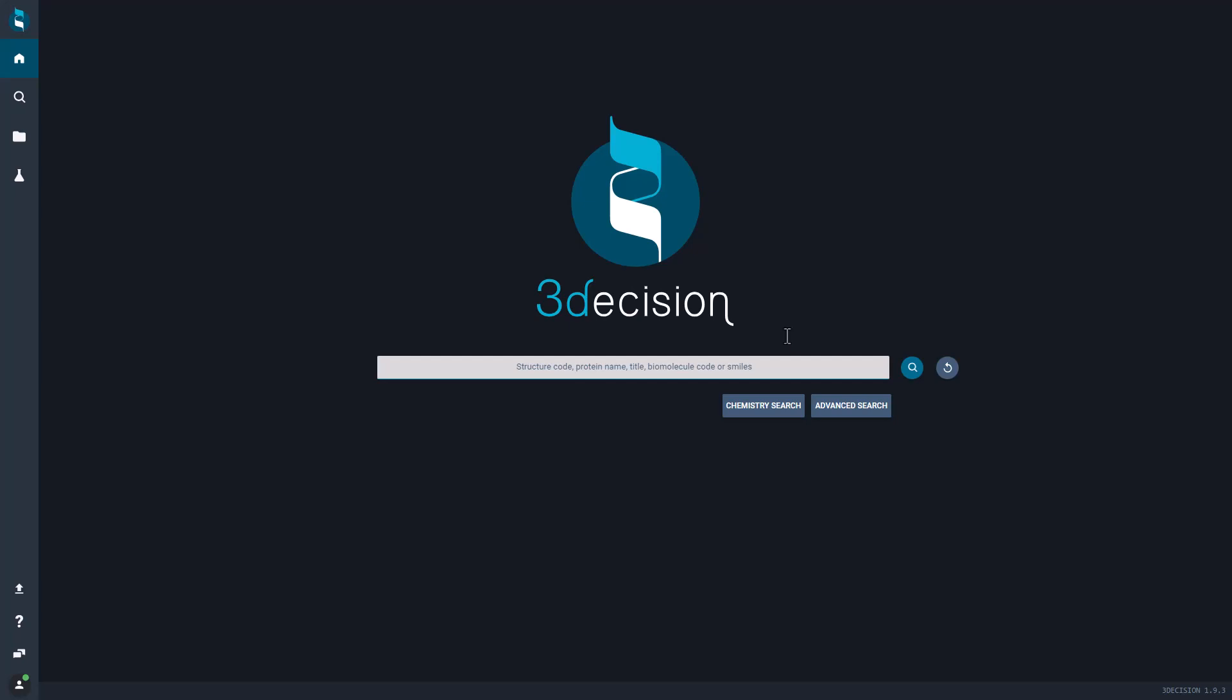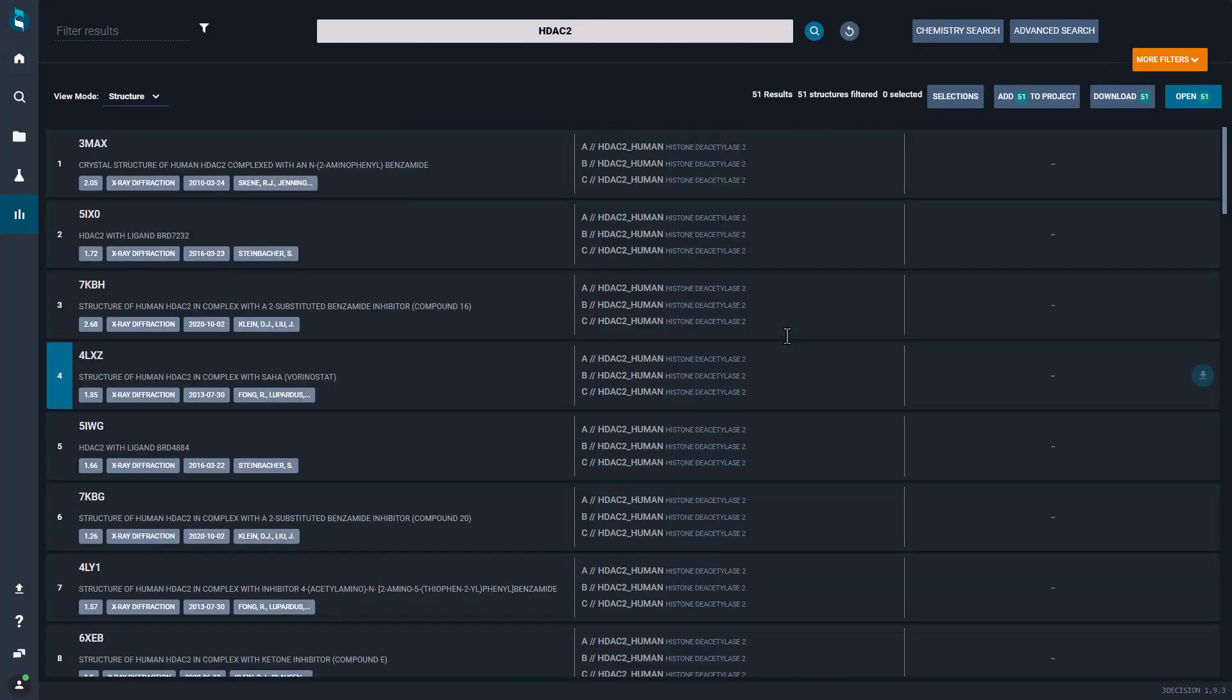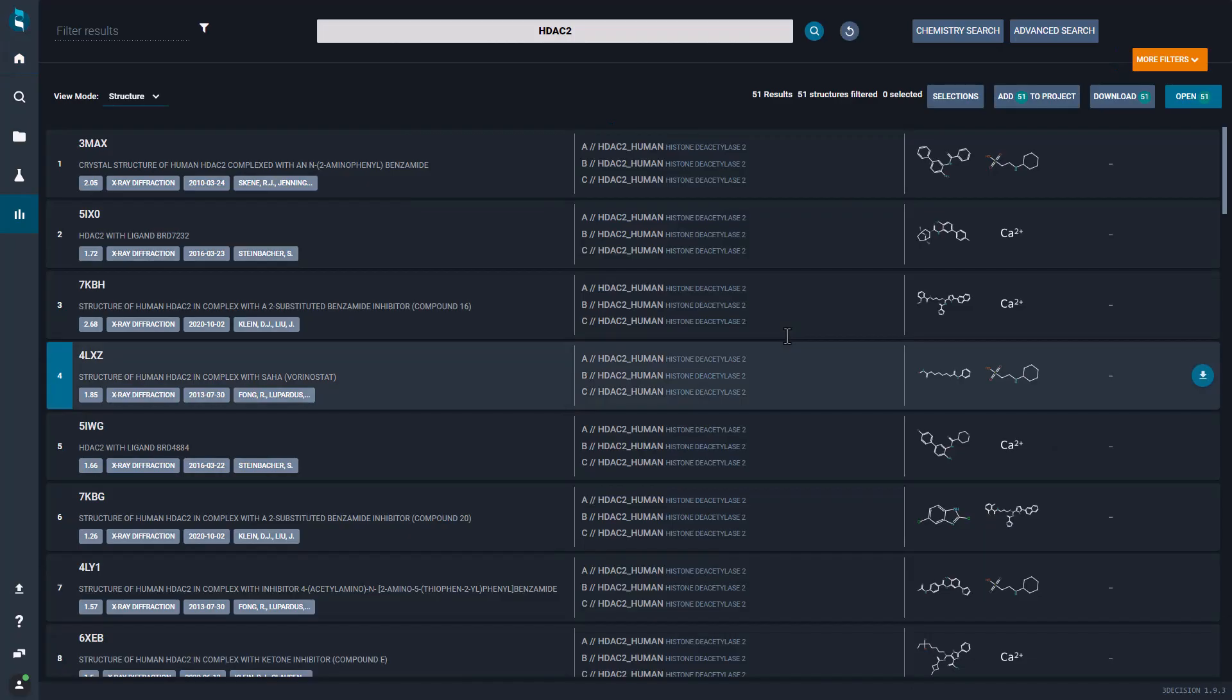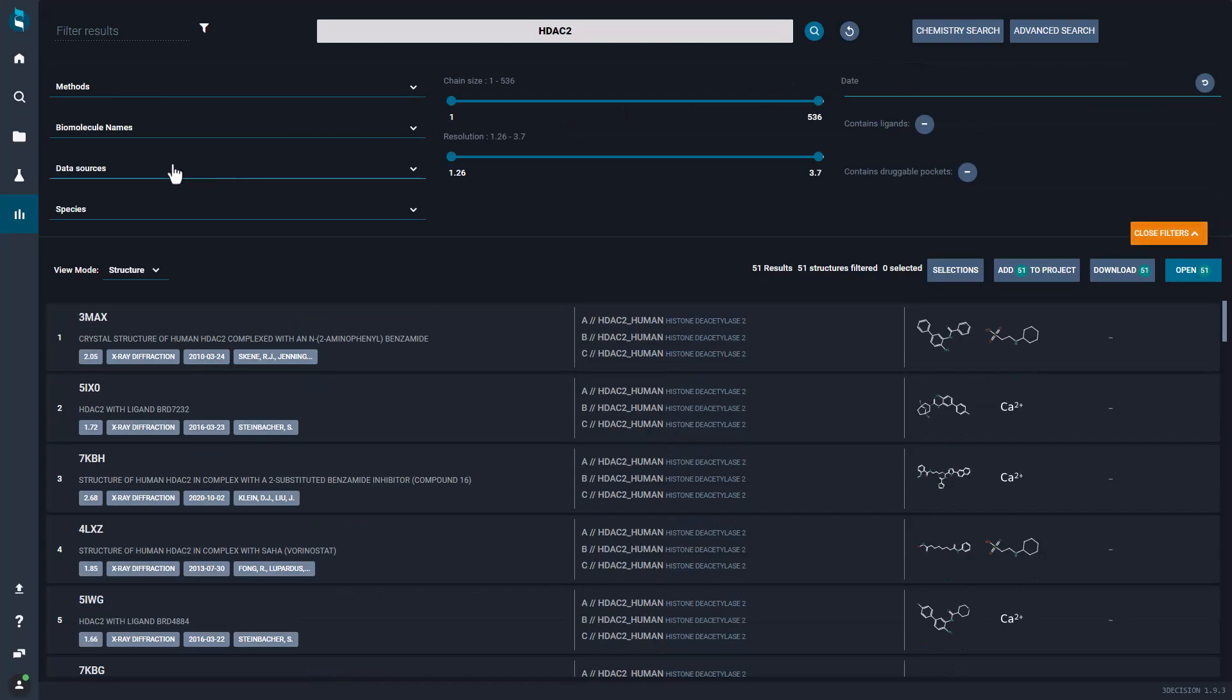To search for an AlphaFold model in 3Decision, simply search for your target and then filter the results by the data source AlphaFold database.